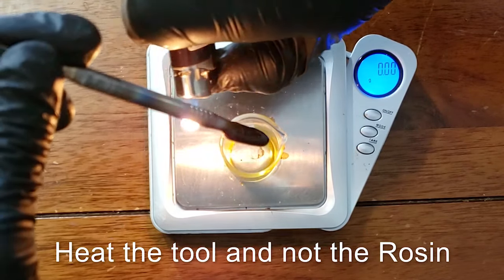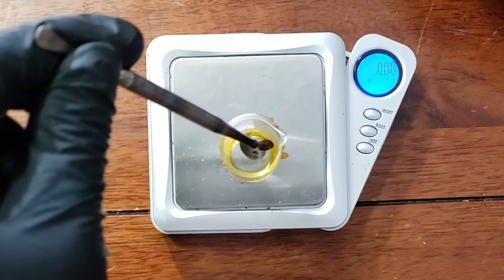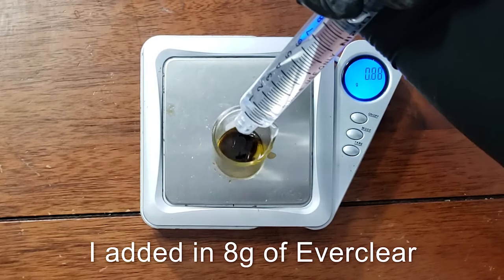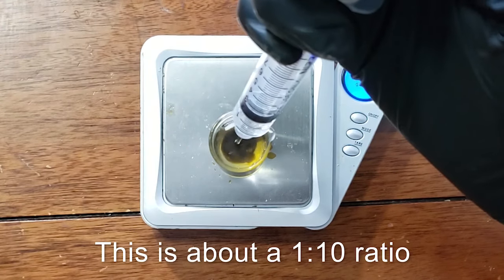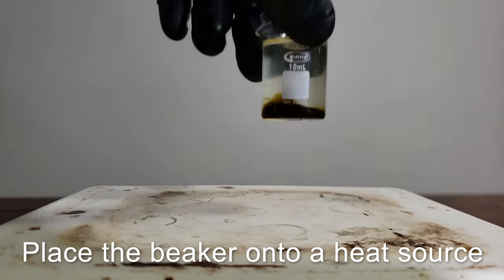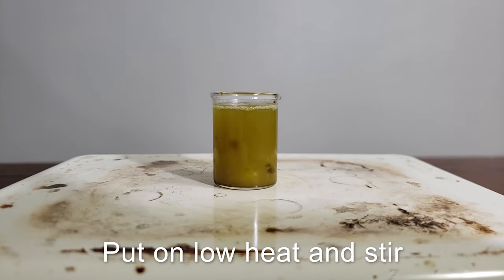Here, I have almost a gram of rosin, about 0.8, that I made just before this video. I'm placing it into a beaker and adding 10 ml of Everclear. I'm adding the alcohol to the rosin so that I can winterize it. Apply light heat and mix until all of the rosin is dissolved into the alcohol.